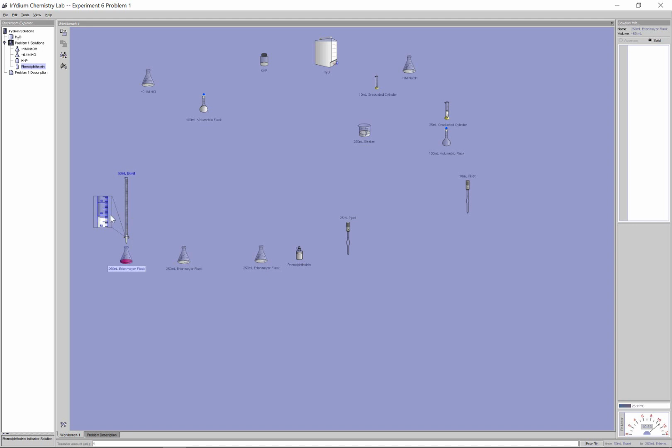I'm going to take down what the buret says. So it's between 49 and 50. I'm going to take down here 49.23, let's say. Let's do a quick subtraction here to figure out about what volume I just tossed in. So just do that there. It says here 33.01. Why is it so much more than the one from before? Again, first thing is totally different set of solutions, but the biggest reason here is instead of just using a 10 ml pipette and testing 10 mils worth of acid, I actually have 25 mils worth of particles, and I'm counting all the particles in the 25. So it took about 33.01.